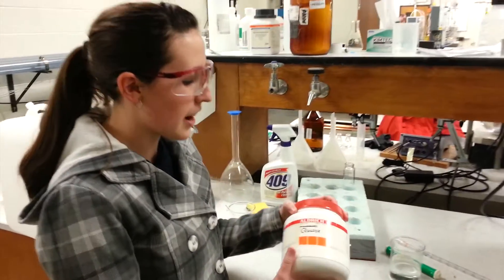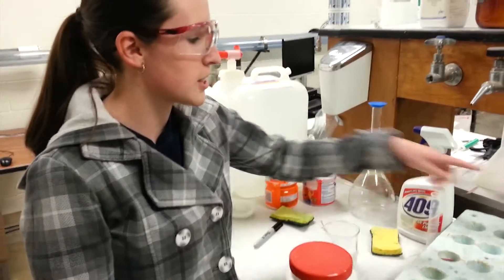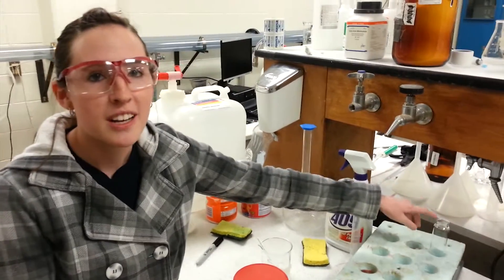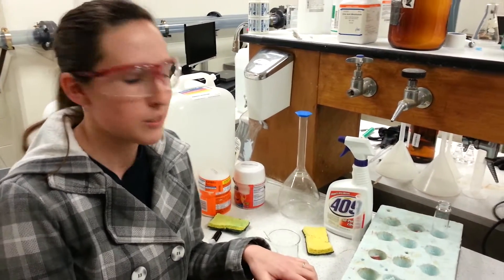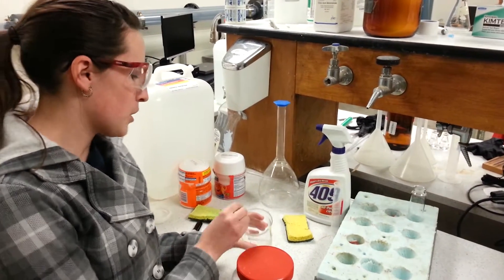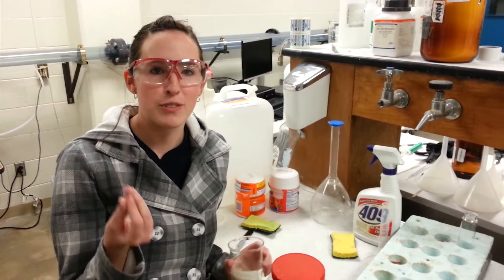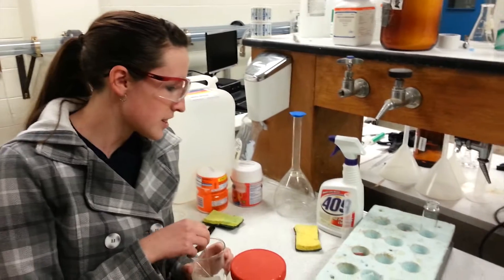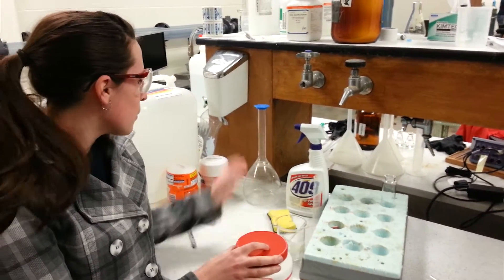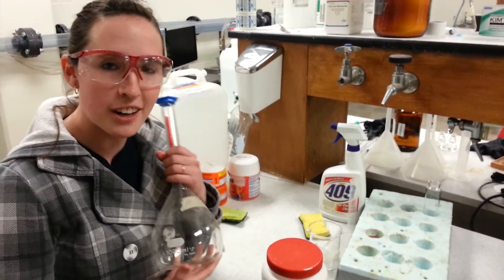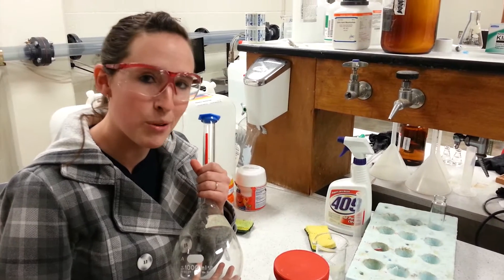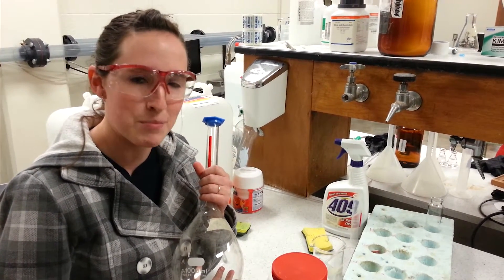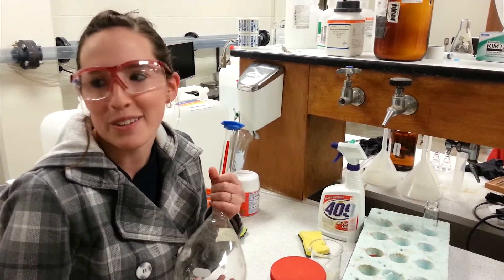One problem that we did have was we put glucose in each of our vials and then added water. But all the glucose is hardened so then we had to chip them out. It broke our stir bar, which was very sad for the day. So instead, next time, we will mix a solution in our volumetric glass and then pour it in so we don't have to chip again and break things. That was the main problem that we've had so far.